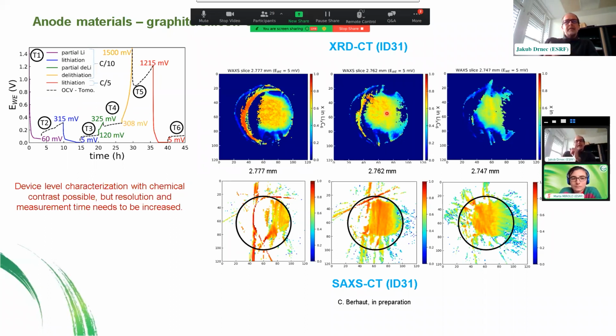Right? And then you can also see that, for example, on the side of the batteries, which is close to the walls here, the graphite doesn't charge at all, while silicon still does, right? So you first do the silicon, then graphite, and then graphite and silicon, like this. So that's important, right? Once you are into the cell design, then you have to think about those things a lot.